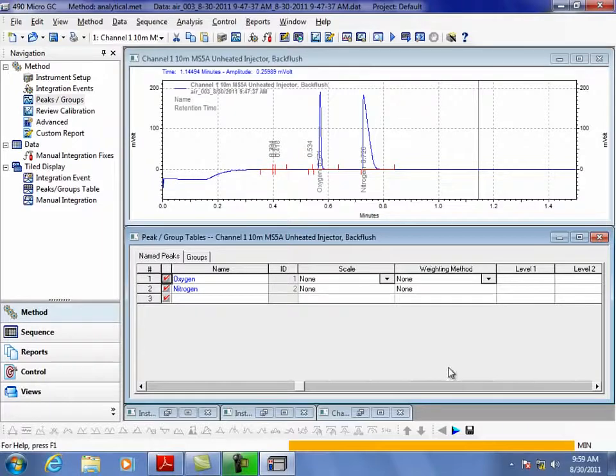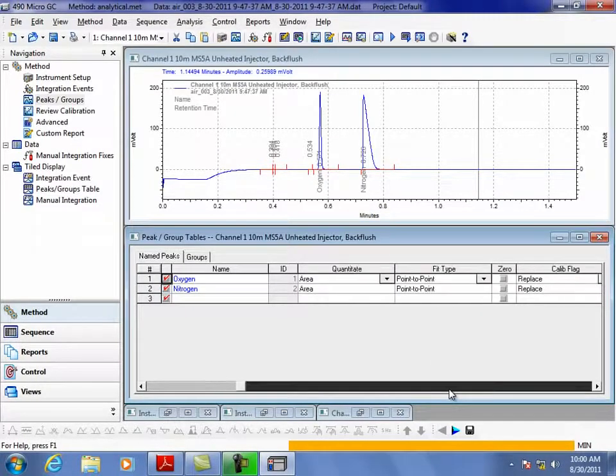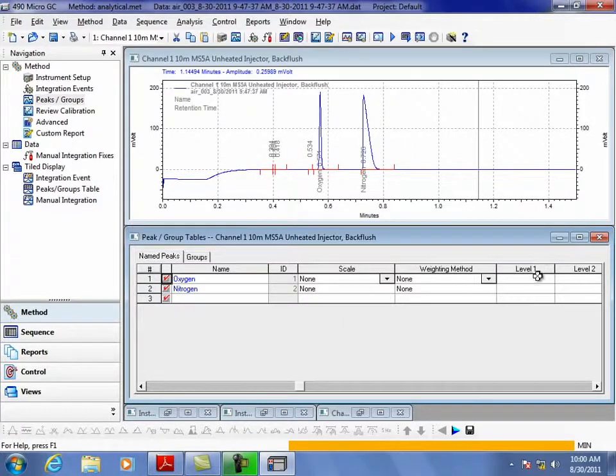And it's got a lot of busy things here that you're not going to need. The thing you need to remember is that you're going to have to work with levels. And the level of oxygen that's in here is about 22. Let's go 22.0. And the amount of nitrogen that's in there is 78.0.